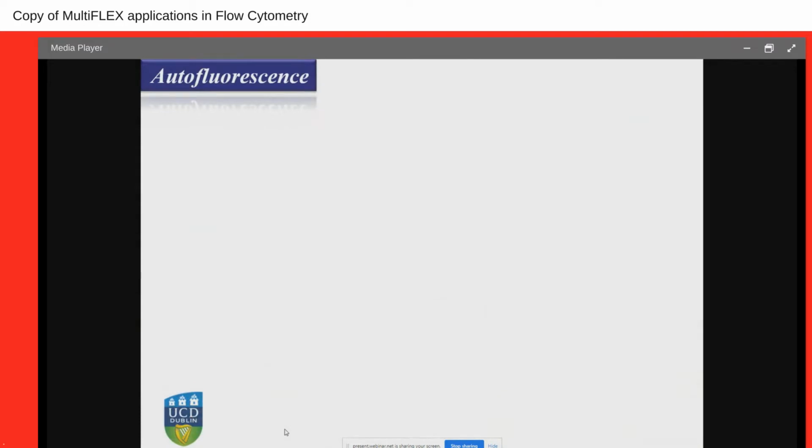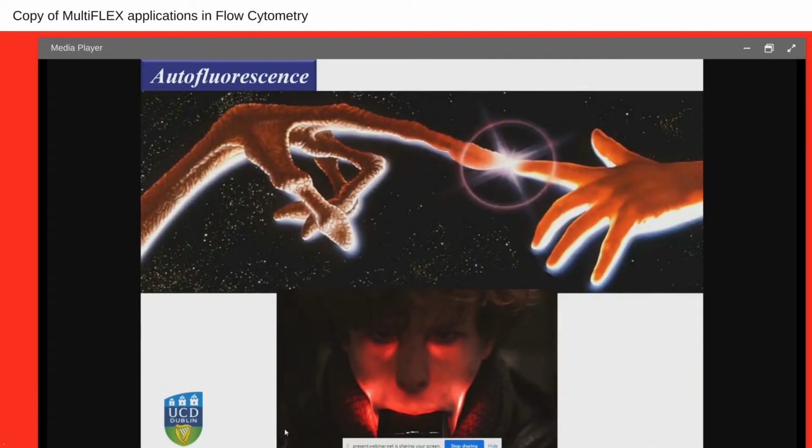So the first thing we will consider is, what about the autofluorescence? Are your cells autofluorescent? What is the minimum autofluorescence? Remember that all of you are autofluorescent. What is the autofluorescence? We put a source of light, and suddenly the characteristics of your cells are transferring, changing the wavelength, producing a different wavelength. So in this case, we are collecting this white light, and we transfer this into a red light. The older you are, the more autofluorescence you will have.